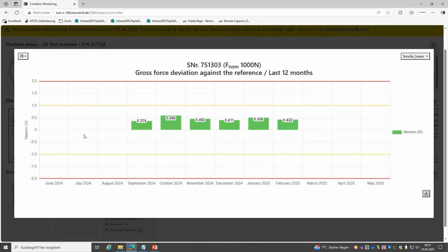What we are doing here is a kind of daily check of this machine. Typically on the load cell, there's a tool, a grip or other accessories mounted to the load cell. And these tools, these accessories come with a defined weight, which should not change. So every time we do this daily check, we measure the weight of these tools and see whether the measurement of this weight is still okay.